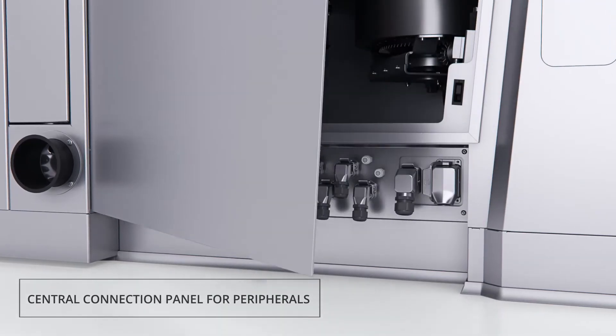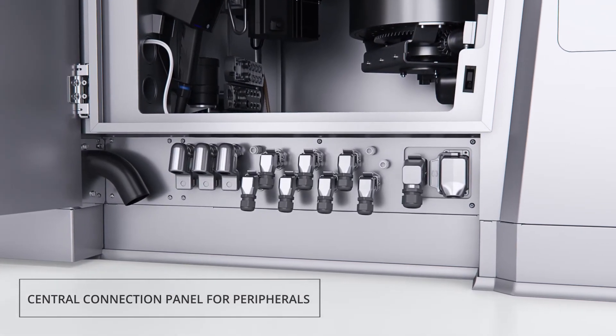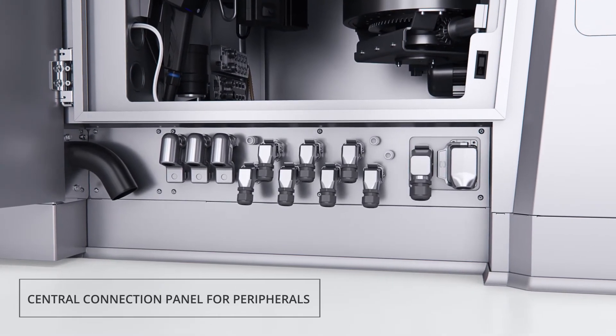An easily accessible central connection panel for peripherals like tablet deduster, metal check, or tablet collection system avoids cables or hoses on the floor.